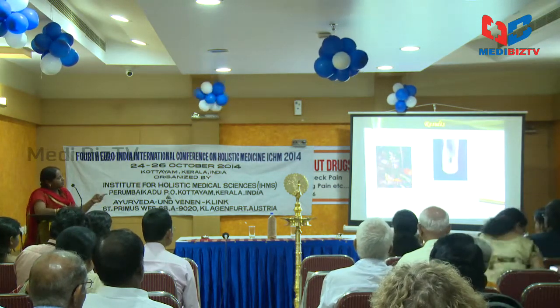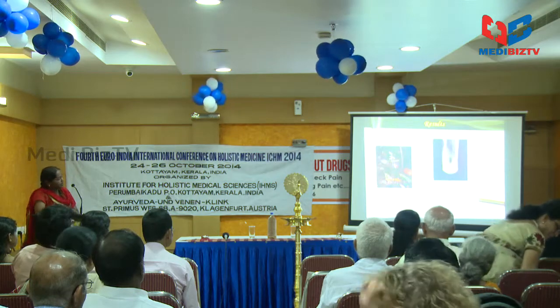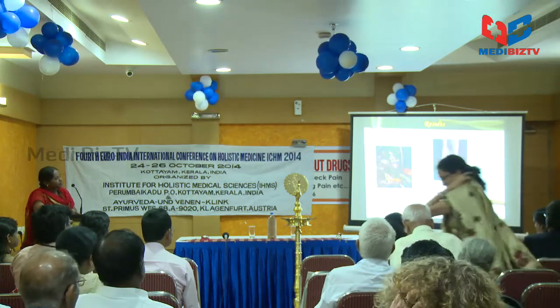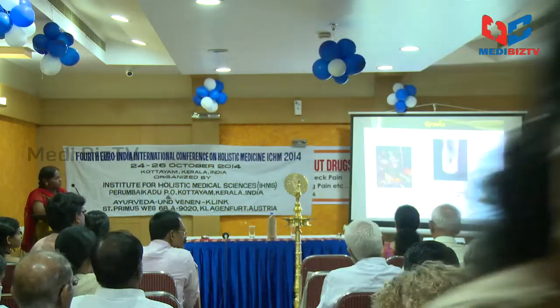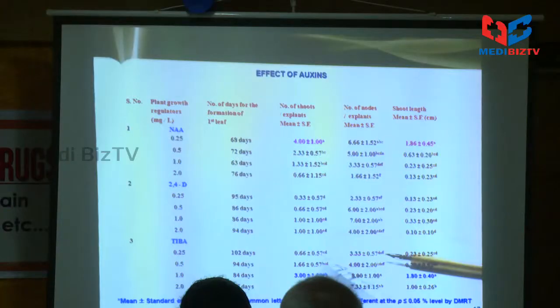Coming to the results. This is the flower of this orchid species. The nodal explants were cultured on MS medium devoid of plant growth regulators, and no response was observed in this medium. Next slide please. This table shows the effect of auxins.